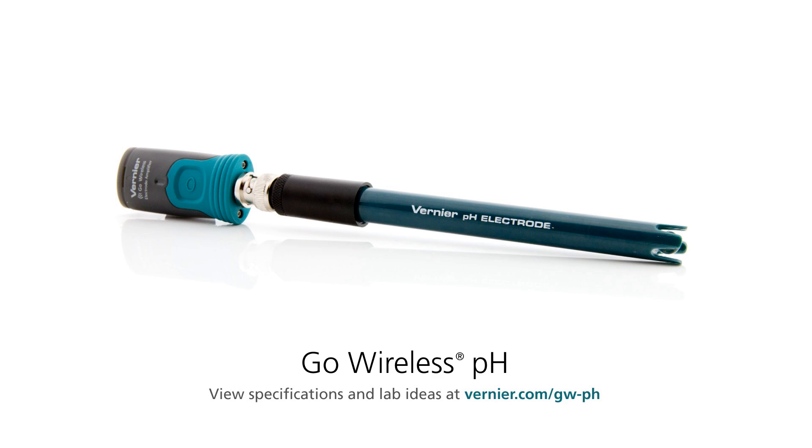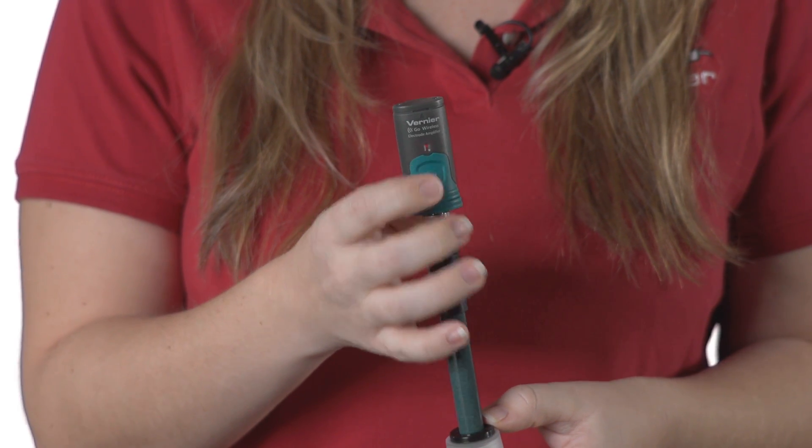First, let's make sure the Go Wireless PH is charged and turned on. I've charged the Go Wireless electrode amplifier overnight with its power cable. To turn it on, I press this button right here.